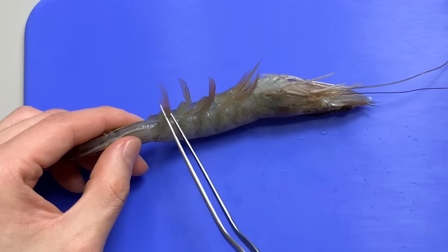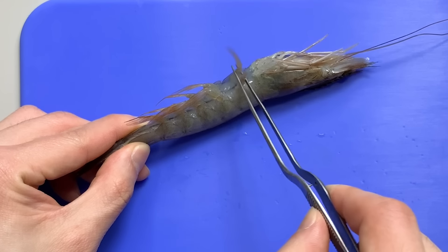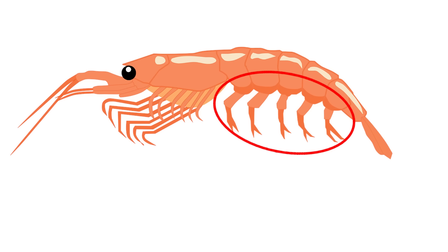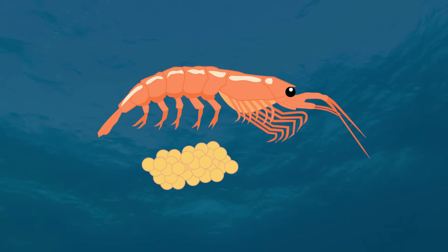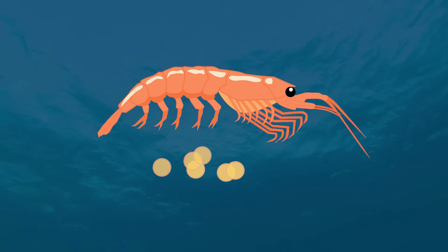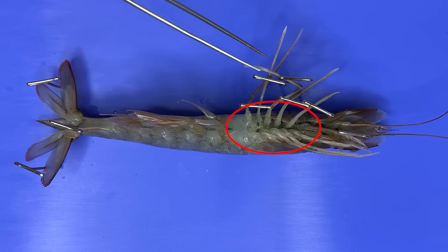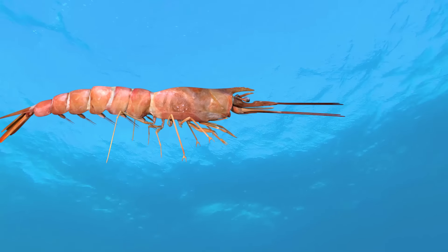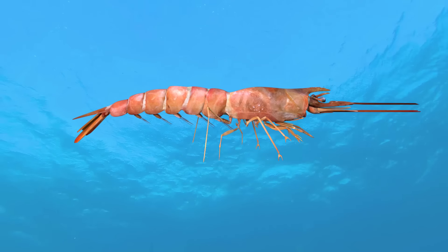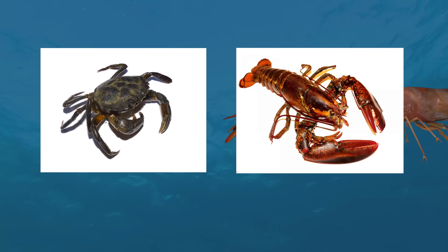First of all, there are four uropods at the tail. When shrimps feel danger, they fold and unfold their abdomen and swim quickly using their uropods. When a shrimp flutters on land, it is an act of escaping. The abdomen is made up of six segments, and the top five sections have a pair of appendages attached to them. These five pairs of appendages are called swimming legs.